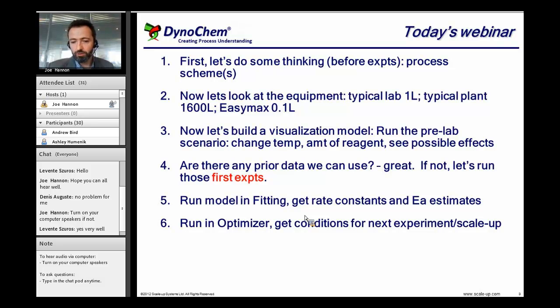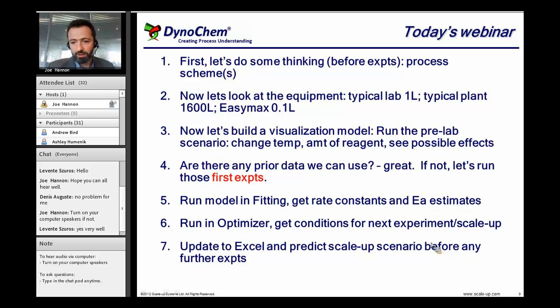And that's a really good indication of the next experiment that we should be looking to run to confirm the model and to tie off the experimental program, or potentially to go directly to scale up if we feel that we already have enough experimental data to support the model.